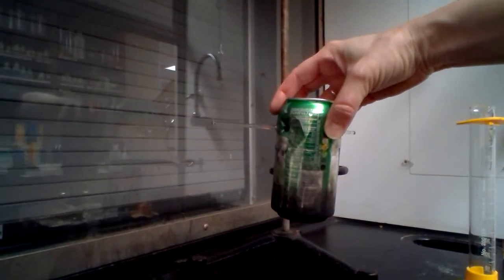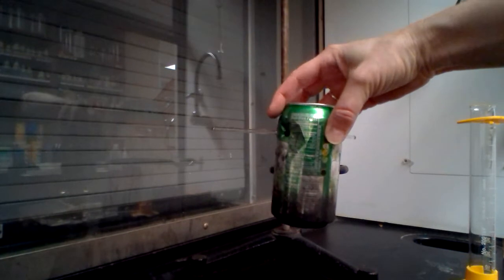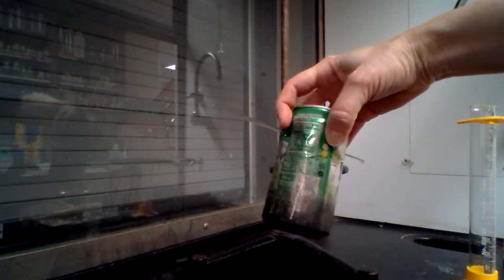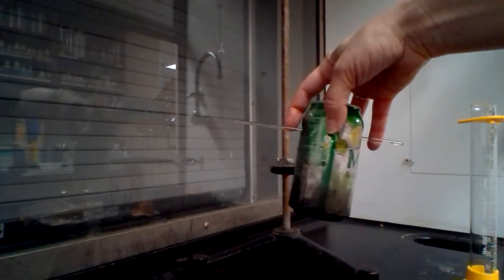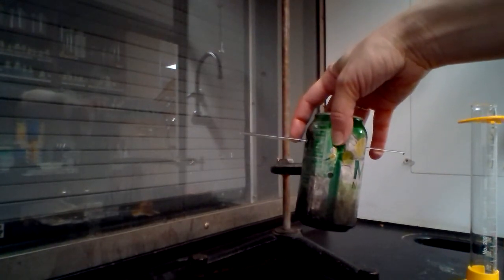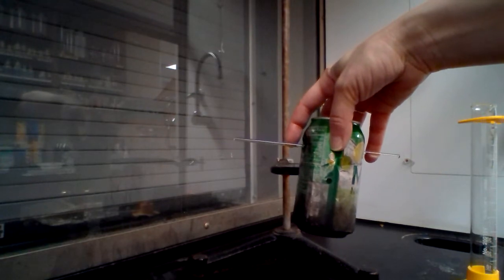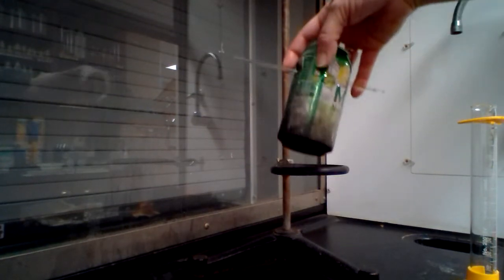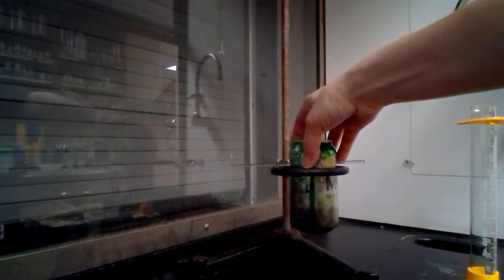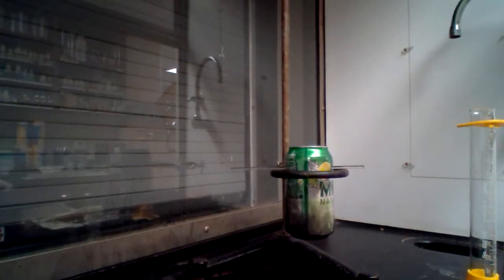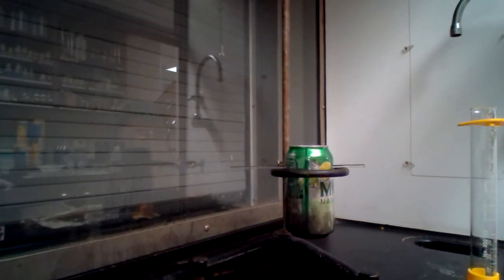So what I've done with the pop cans is I've placed a hole on either side so that way we're able to place the glass rod through it, so then we can suspend it onto our ring clamp.